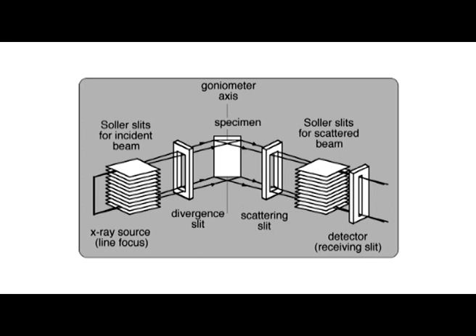There are a lot of other manufacturers also. They will have something similar, but slightly different in terms of configuration. There you can see a set of optical inclusions within an XRD technique, which are compulsory, and which we will see in a short while.